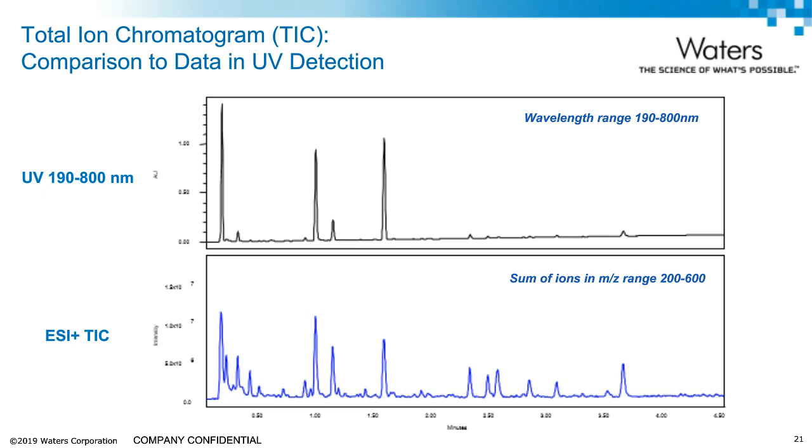In the TIC trace, there appear to be many more peaks. This is due simply to the higher sensitivity of the MS detector relative to the UV. In addition, some of the larger peaks are in different ratios. That is because chemical species can have very different ionization efficiencies. Relative response of analytes also varies within each technique. The y-axis equals counts in the MS trace and absorbance units in the UV trace.